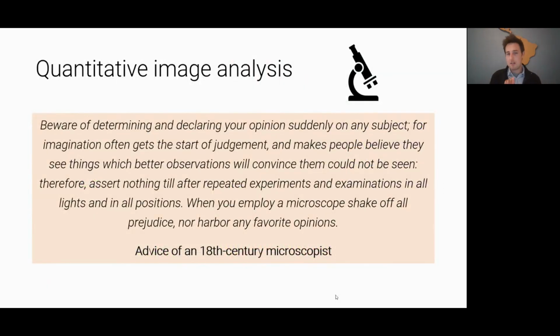The second last part of this talk, and I did warn you, sorry, there's going to be a crash course, a whistle-stop tour, really just to make you aware of all these things because they are important. I don't think we spend enough time talking about quantitative image analysis. Too often people are very happy just to put a representative image in a presentation, in a publication, and just assume that's okay. But then I'm always reminded of this fantastic advice from almost 300 years ago.